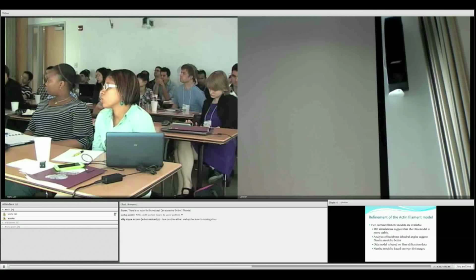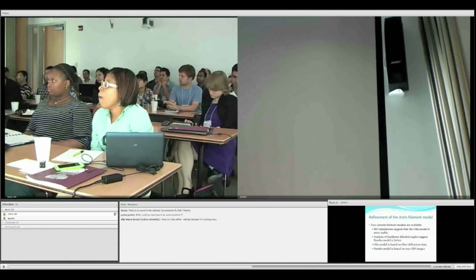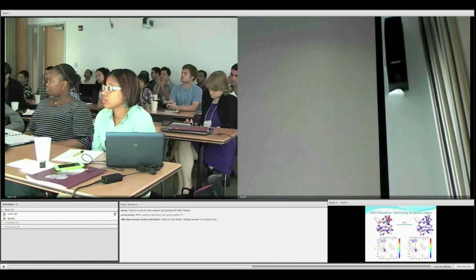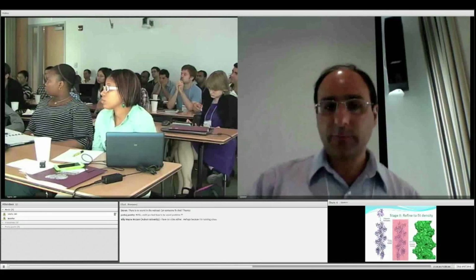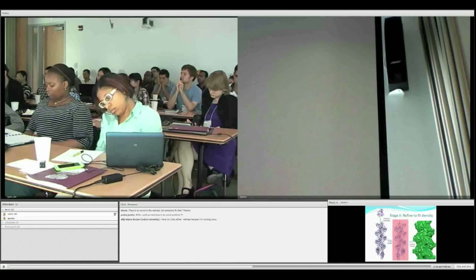You have probably heard a lot in this workshop that one of the things we are working on is actin. There are two different filament models available for actin. One is the ODA model, which is more stable during the MD, and the other is the NAMBA model, which has the better dihedral angles. There are two available actin filaments published today, and the monomers have different structures.